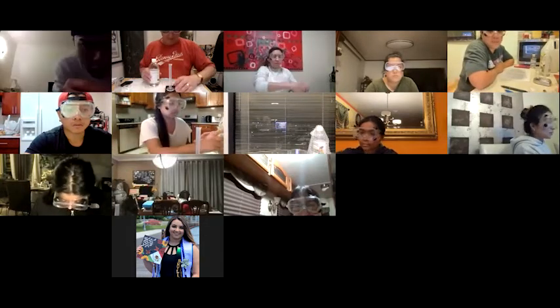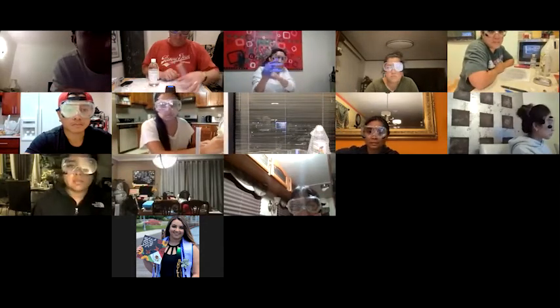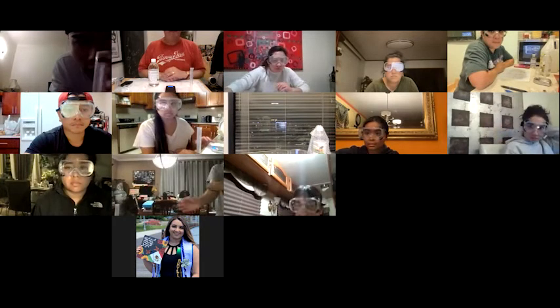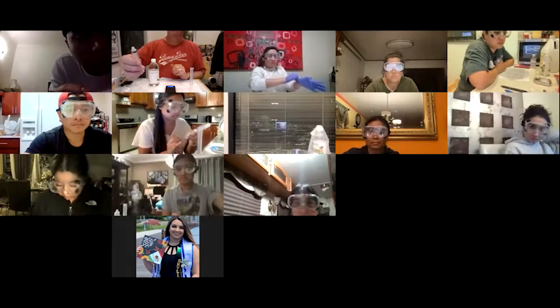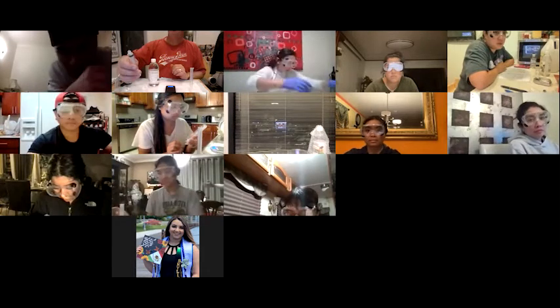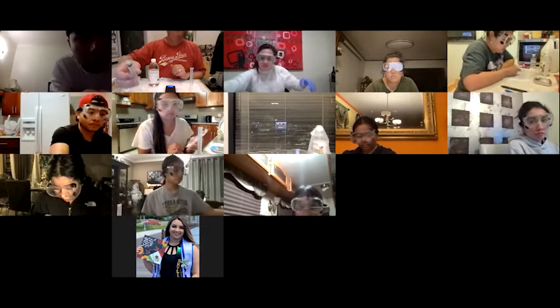Professor, I have another question. For measuring 0.5, the tick marks, are they going by, for example, 2? Yes, you want to be halfway. There are 5 tick marks for every mil. So half would be 2.5.